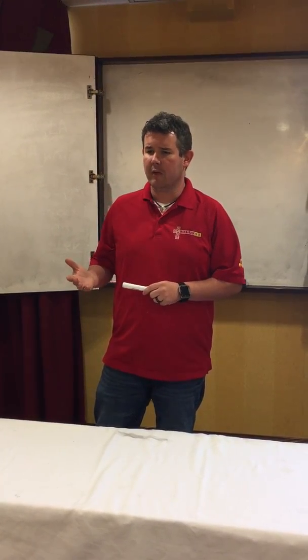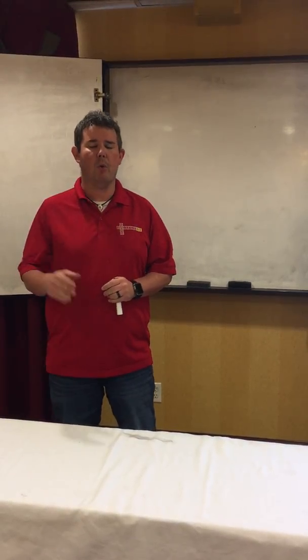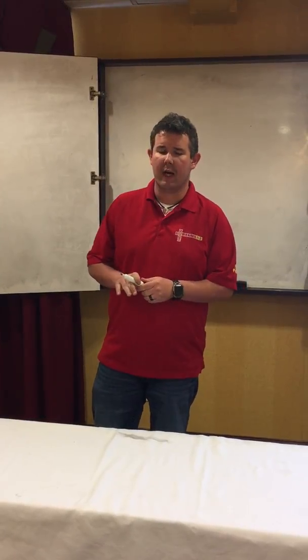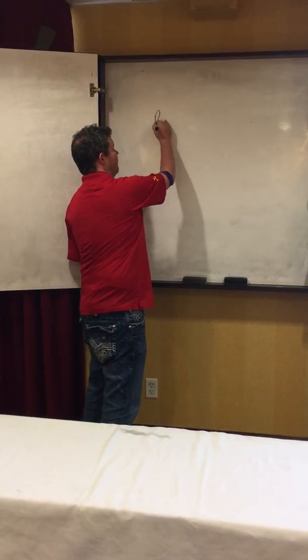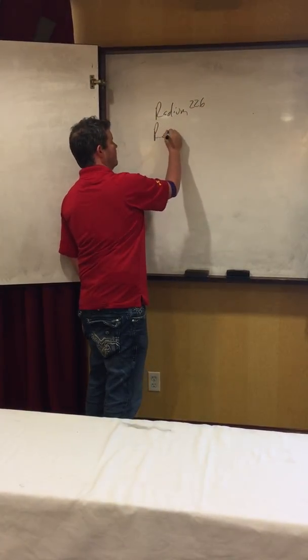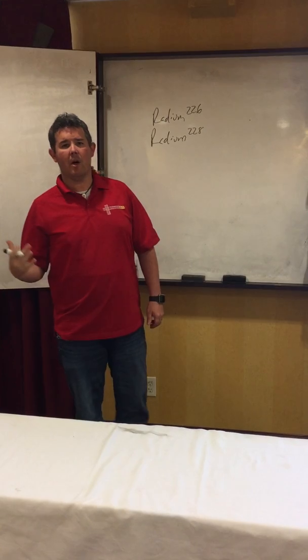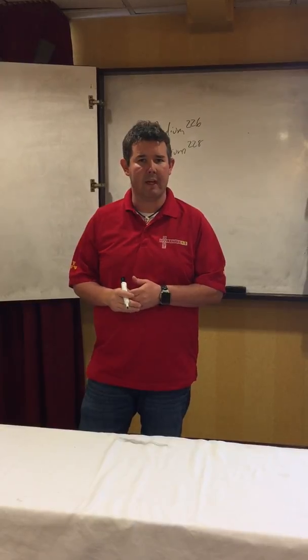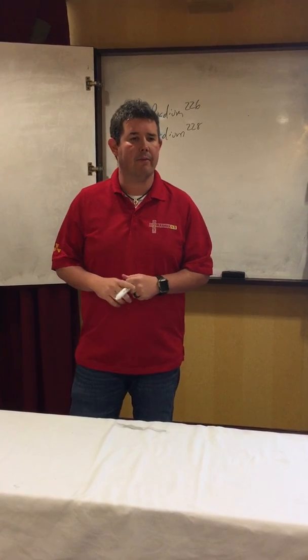So I'm going to list the 6 radionuclides that we need, and then I'm going to put why we need those particular 6, okay? The first 2 radionuclides that have to be listed on our gamma spec reports are radium-226 and radium-228. Those are going to be our primary radionuclides. All of the other daughter products that we also have to have listed derive from the 2 radiums. It's very important that we have those 2 up there.